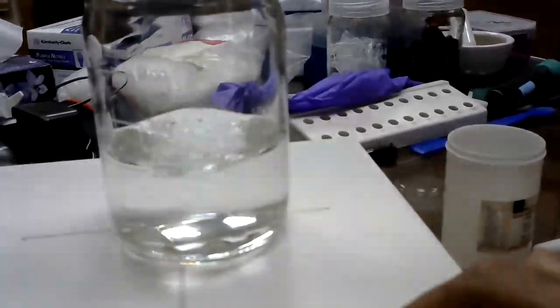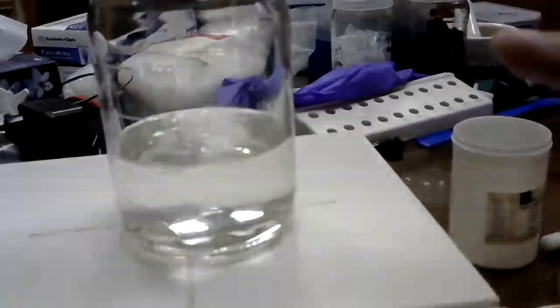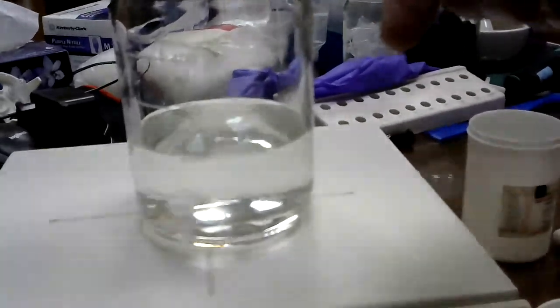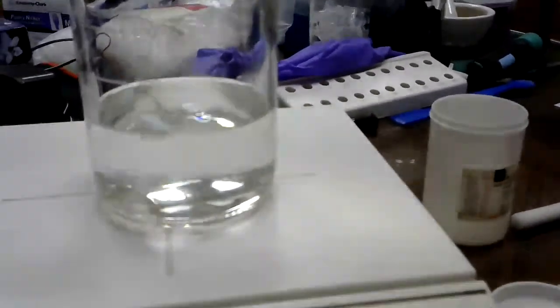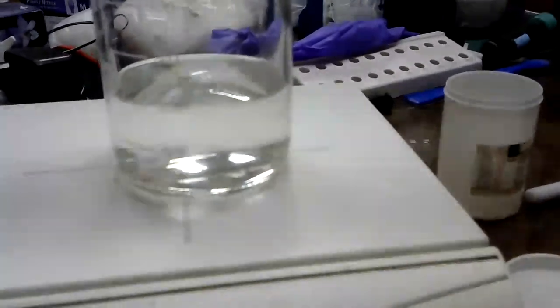So while adjusting the pH, it is recommended that the solution should be mixed, and whatever NaOH or KOH you are adding will be mixed together, and then you can take the reading of the pH value. Unless you are mixing, the pH will not be adjusted accurately.